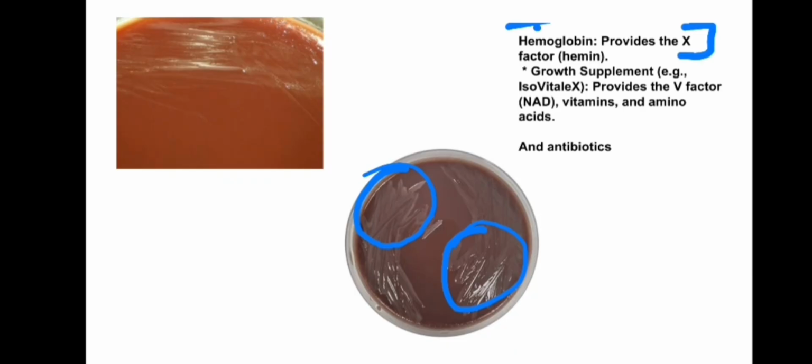And the student has taken a bit large amount of inoculum initially, so it depends upon what is the aim. If you want an isolated colony, then you can go for a proper technique, right?